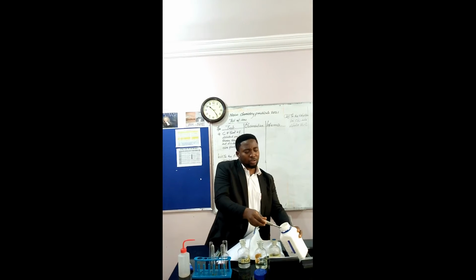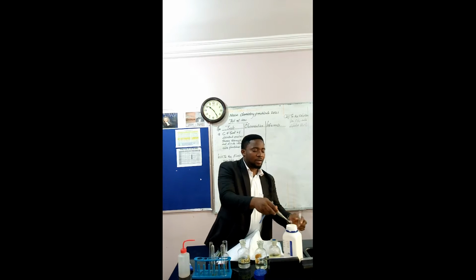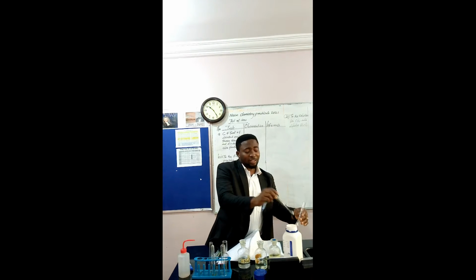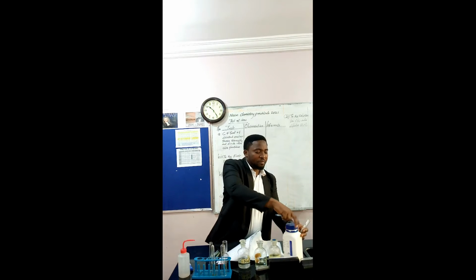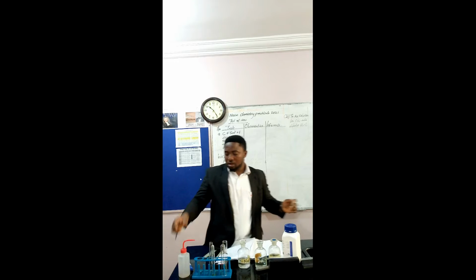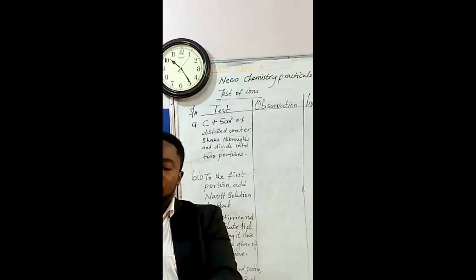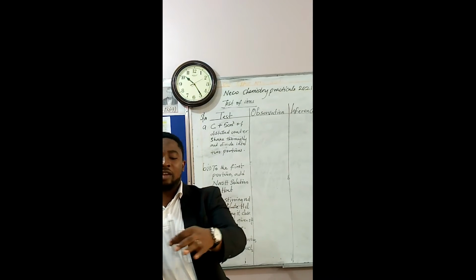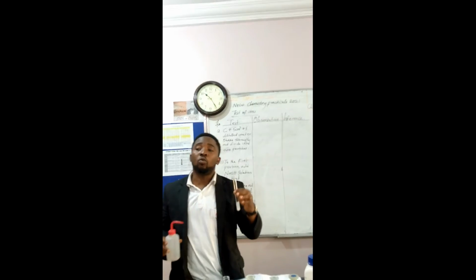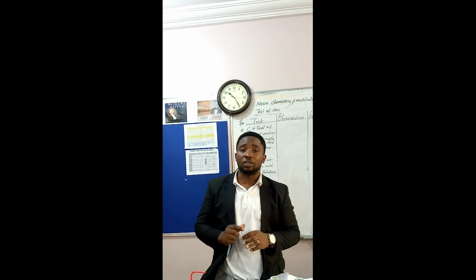And this salt is always unstable to heat. It decomposes easily on heating to produce ammonia gas. So that is one of the characteristics. So I have my sample C. So I'll add 5 cm³ of distilled water as instructed and shake thoroughly. And remember, whenever you are asked to add water to a salt sample, they simply want to test for the solubility of the salt.